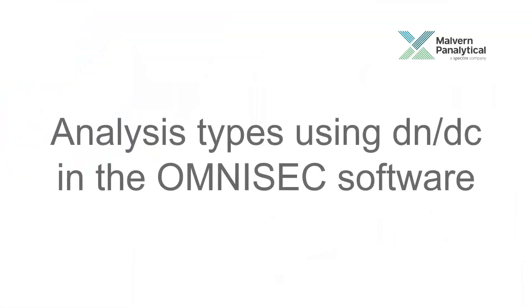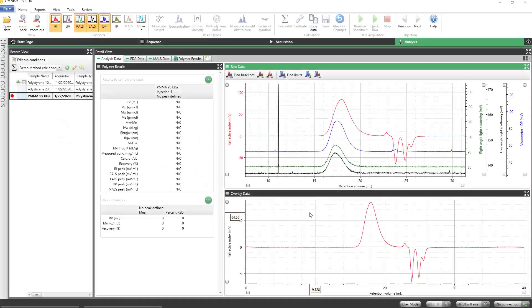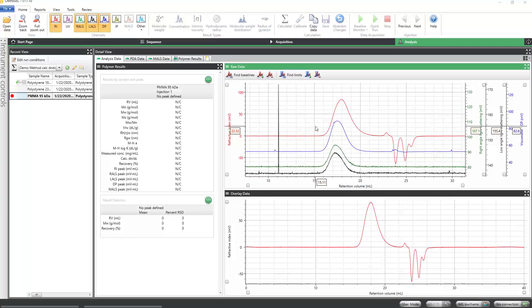Analysis Types Using DNDC In the Omnisec Software. When using the Omnisec software to determine absolute molecular weight, there are multiple analysis type options from which to choose.